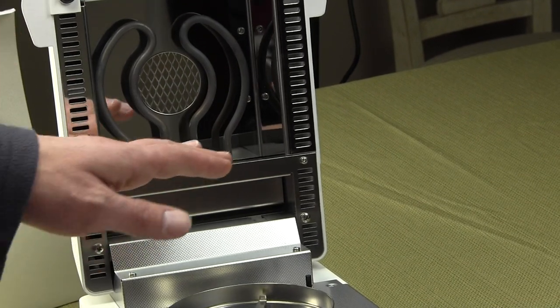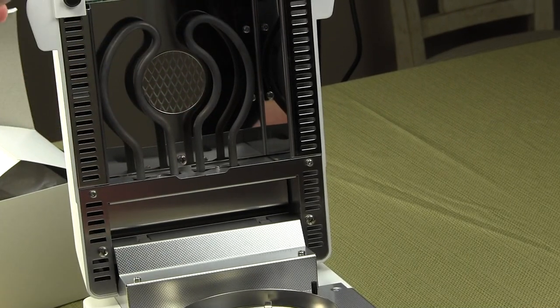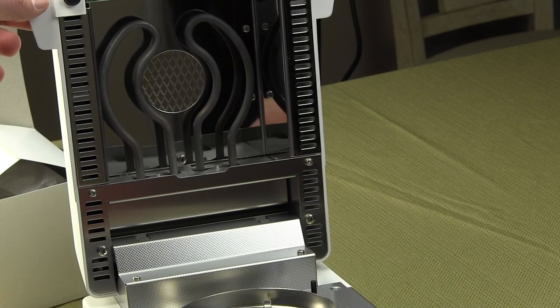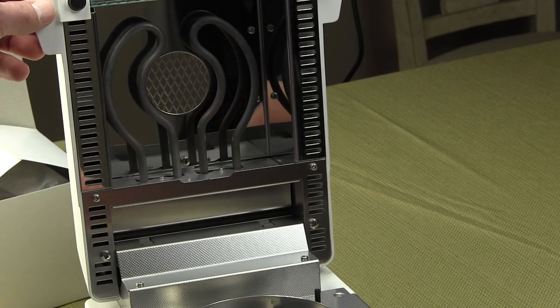With halogen bulbs, a lot of times staff at your facility might decide to clean the unit, and if they touch the halogen bulb, it will burn out in a matter of a few hours. With this metal tubular element, it really will last a lifetime.